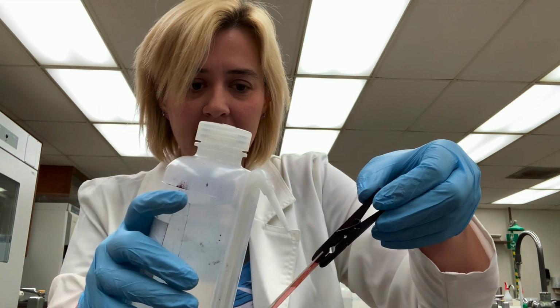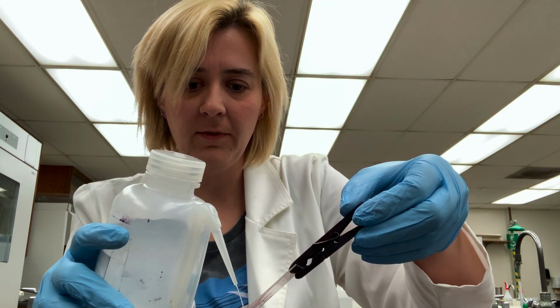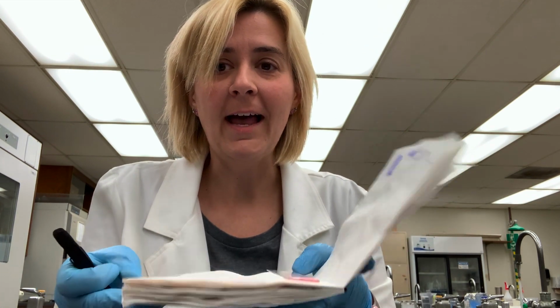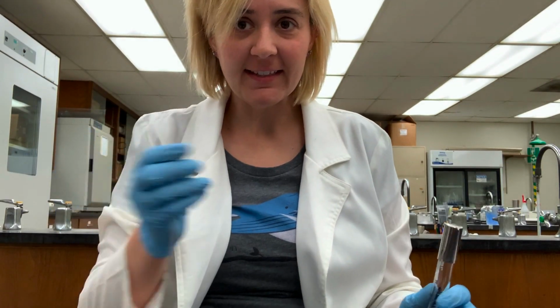Okay, so it's now been about 30 seconds. So I'm going to pick up my slide using the clothespin because I don't want stain all over me, and I will rinse off the stain very carefully. Okay. So I'm going to place my slide in the blotting paper to help it dry off. And then what I'll add at the end of the video is a picture of what the cells look like under the microscope. I'm gonna set up one more direct stain because we do have 3 that we can test.